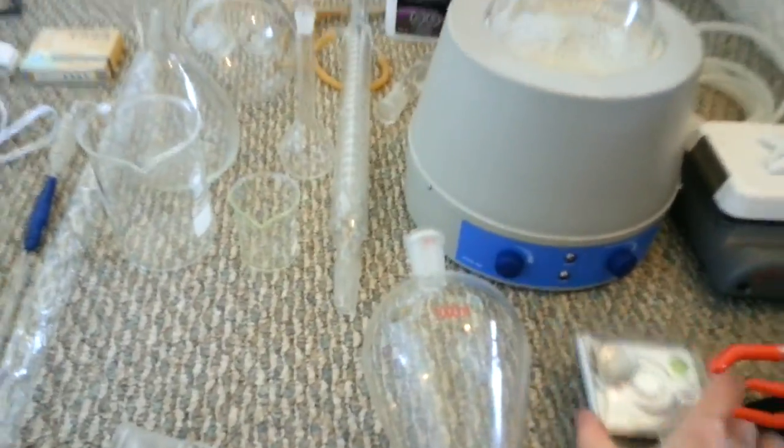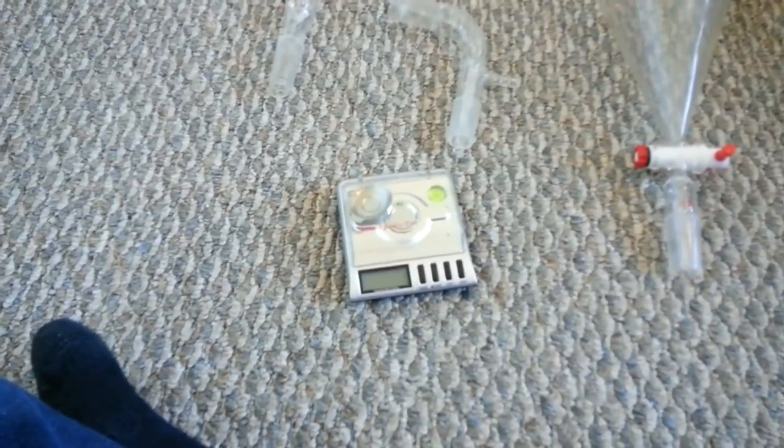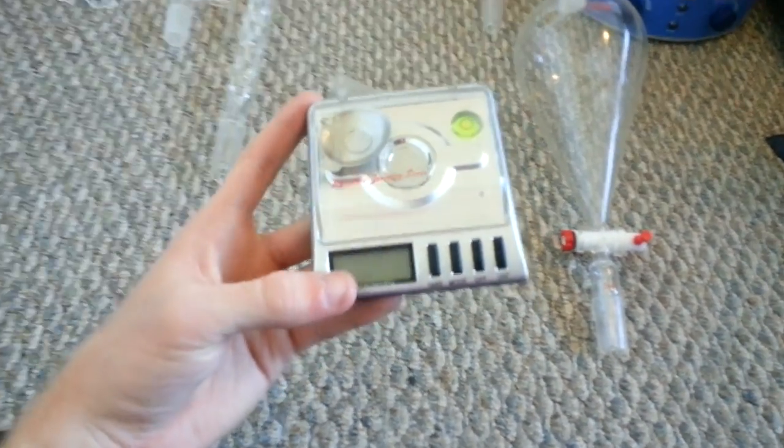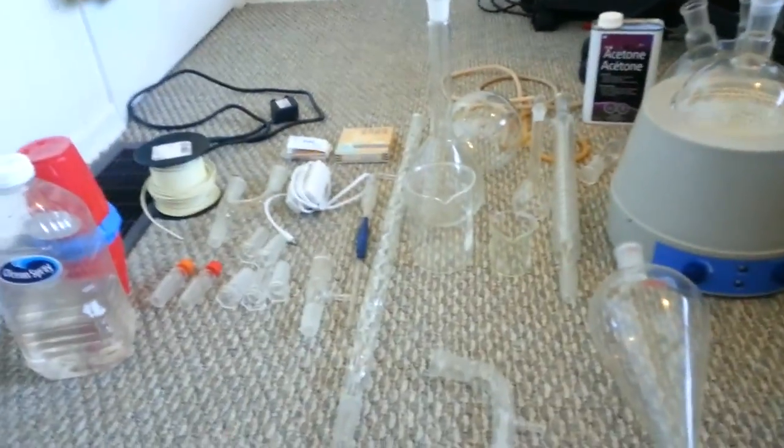A milligram scale is good to have. This one is like a jewelry scale — it's plus or minus one milligram. These are pretty good; you should get one. Not too expensive — I think that was like $25 or something like that. Certainly reasonable.